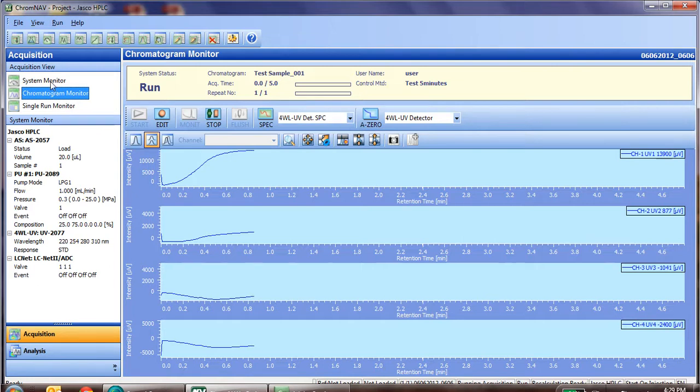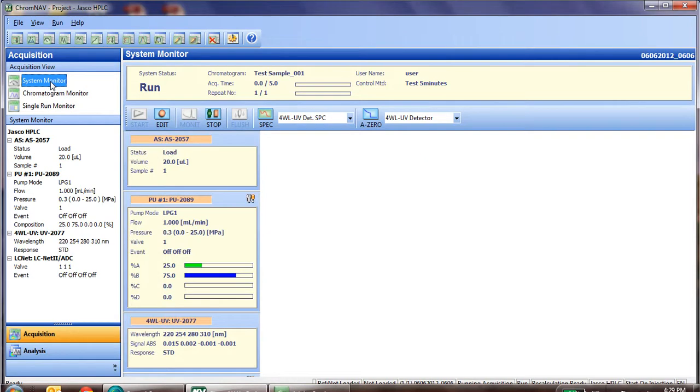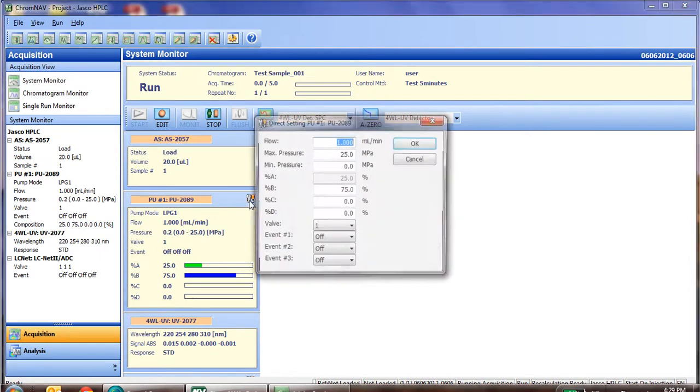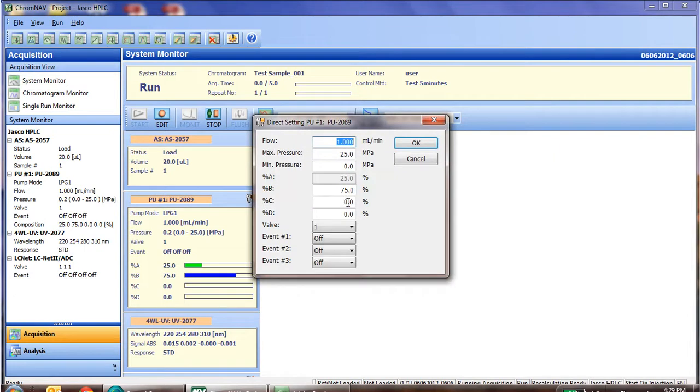At any time during the run once it is injected, we can go to system monitor and change the current conditions. For instance, if we want to change the percentage or the flow rate, we can change those on the fly by simply clicking the wrench and screwdriver and changing the value you wish to change.